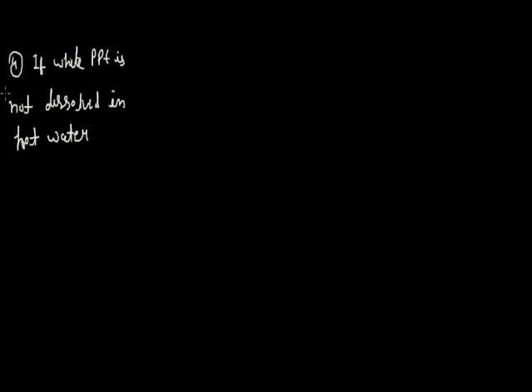Means if PPT is not dissolved in hot water, then it is confirmed that this salt is not having Pb2+. Now the problem is that in this salt there may be either Hg2 2+, that is mercurous, or Ag+.